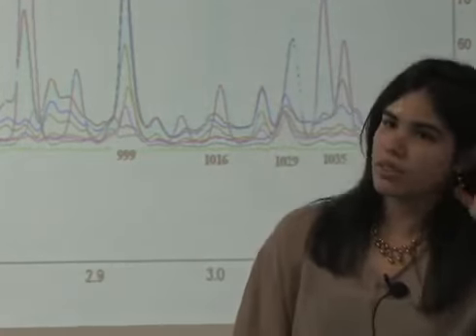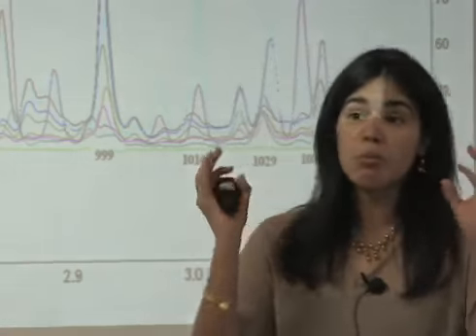Theoretically all the leaves contain the same components, and all bark contains the same components. But when we put the samples, we have to expose them to a SPME fiber, which picks up the components from the environment. So we need a significantly greater amount of leaf or bark in order for the fiber to pick up those volatile chemicals. That's why they came up with this idea of 3 grams, and I cannot get 3 grams from one leaf, but I understand your point. That may account for the standard deviations, yes.